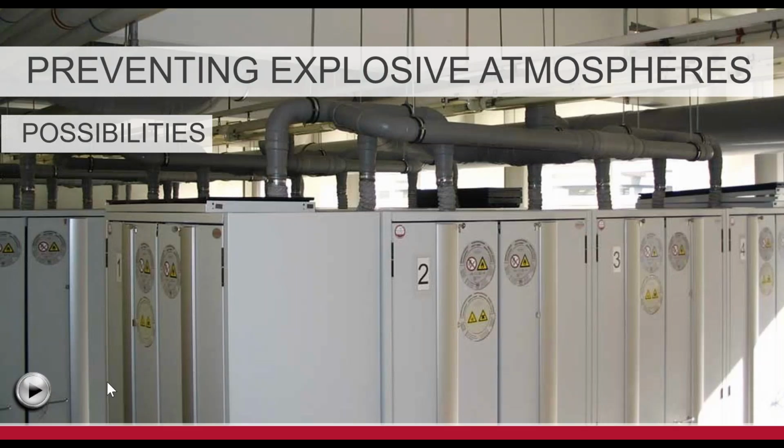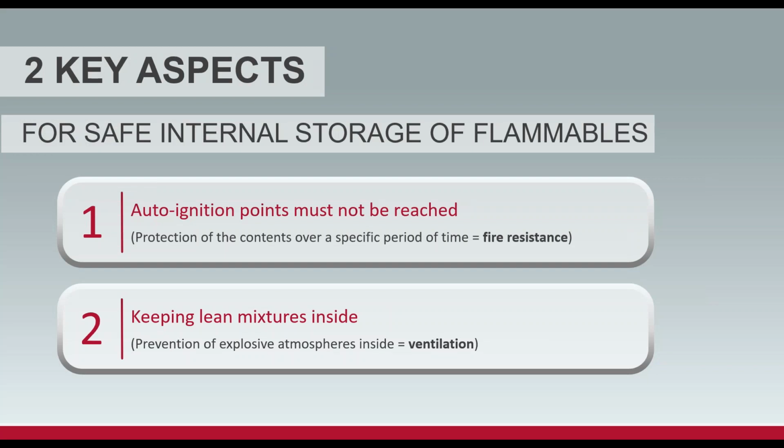So ventilate. You can do that by venting to the outside. There are some carbon filtrations that are out there. All of that will work as well. All right, so auto ignition point can't be reached. That's the importance of fire resistance, right? So you've got to keep the fire and the heat to the outside of a cabinet, to the room, to the storage room. So you've got to create a box that keeps that heat to the outside.